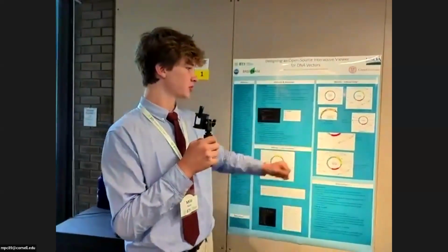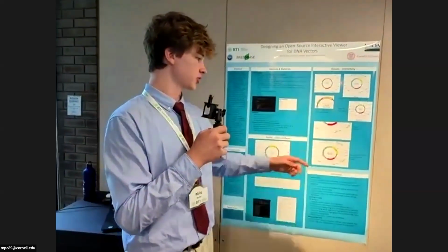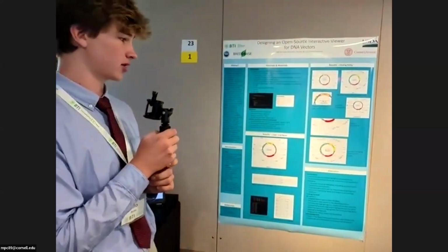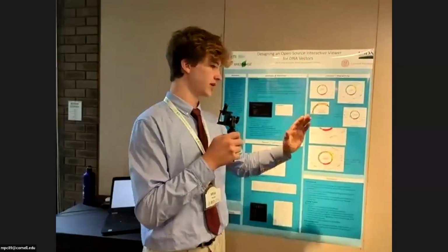Figure 8 and figure 9 show how you can zoom in and zoom out using the plus or minus button. And then figure 10 shows how you can locate any point on the vector by just hovering over the vector, and it'll show you a number, which is base pairs into the vector.